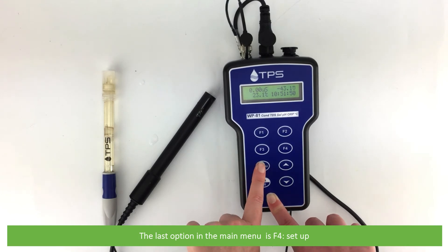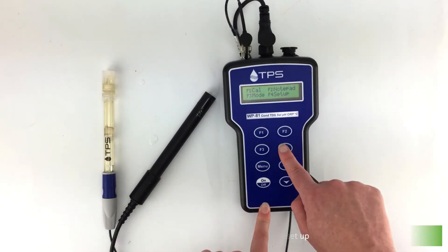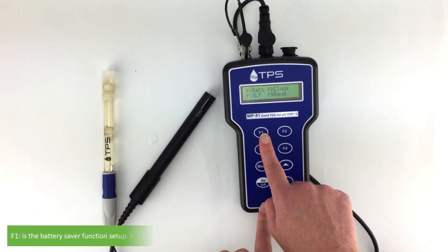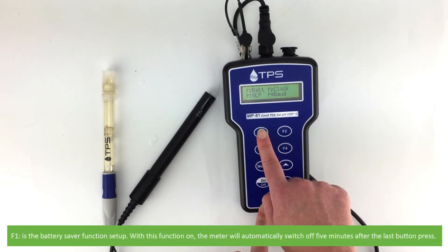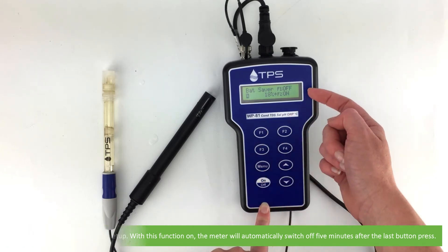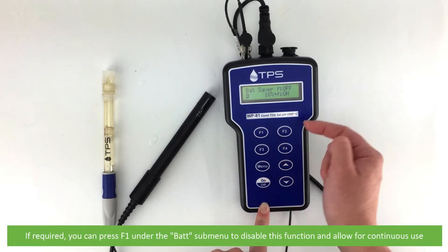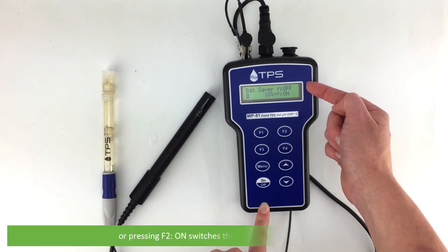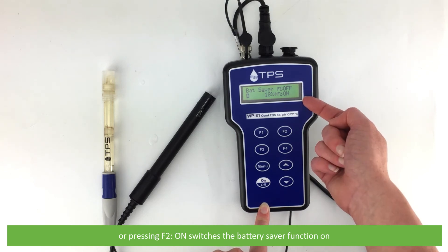The last option on the main menu is F4 setup. Entering into the setup menu displays a submenu with four additional options. F1 is the battery saver function setup. With this function on, the meter will automatically switch off five minutes after the last button press. If required, you can press F1 under the bat submenu to disable this function and allow for continuous use. Pressing on switches the battery saver function on.